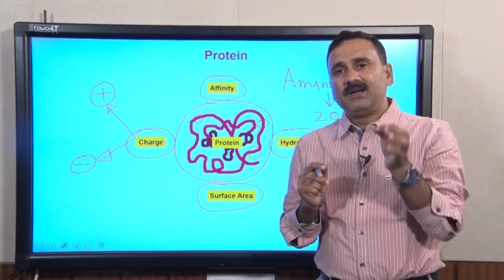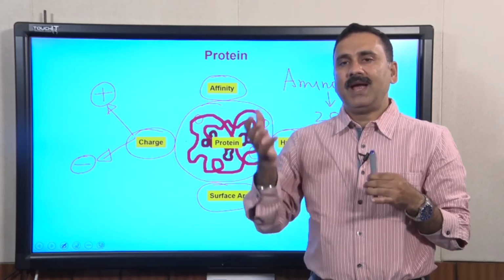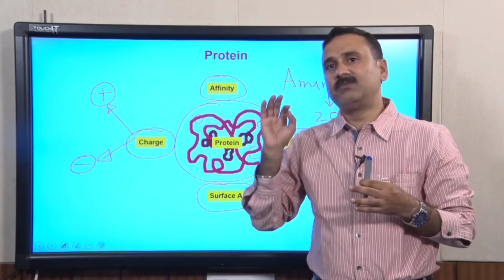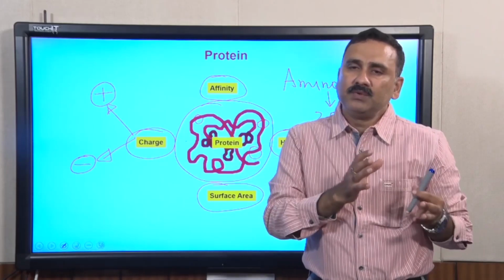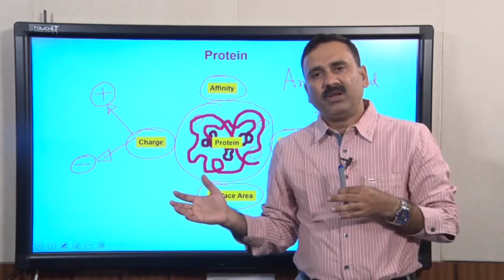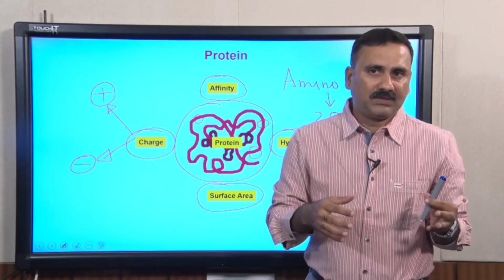So, the single stranded DNA binding protein has a charge distribution as well as another kind of amino acid distribution in such a way that it has a very high specificity for DNA. And that is why if you use DNA as a ligand, you could purify the single stranded DNA binding protein from the crude lysate.